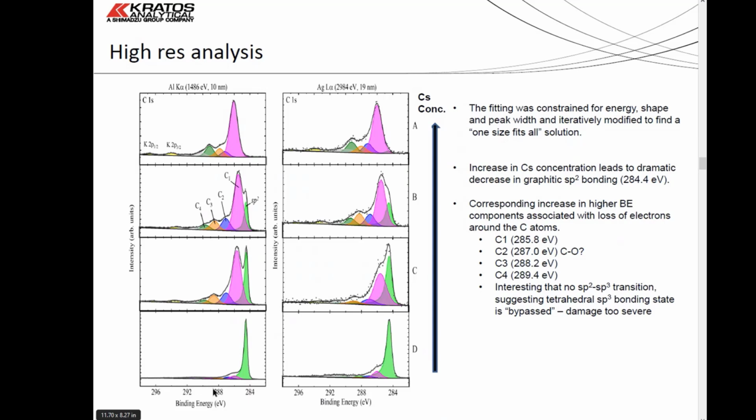So we looked in these 4 positions again, and you can see in position D, this just looks like HOPG. This is data acquired with a silver source. So this is a silver L-alpha, and that's aluminium K-alpha. Just so you're clear, 1486, 2984. So on the right, we're looking deeper. On the left, we're looking shallower, essentially.